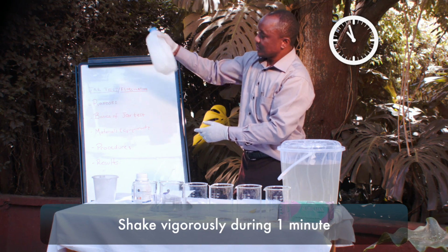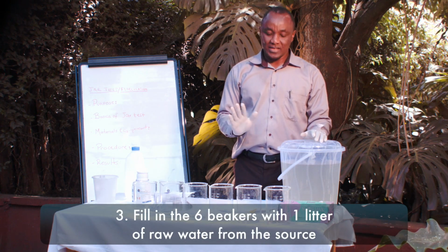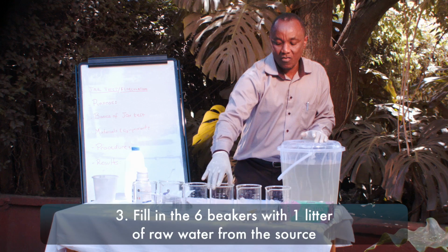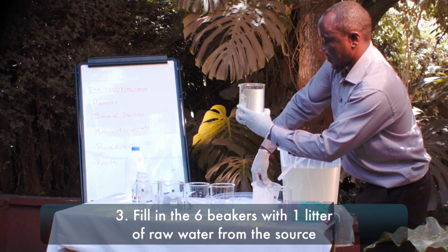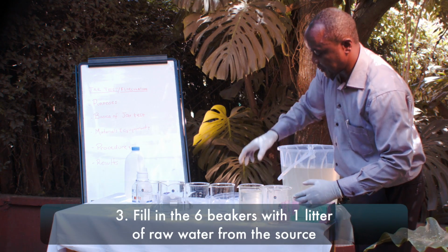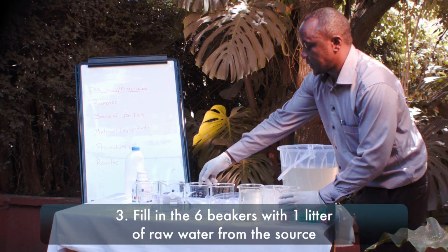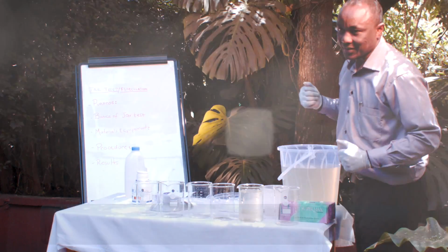The third step is to fill in these beakers with 1 liter of water from the source. That's 1 liter of raw water, to be treated. Fill all the rest the same, and then we go to the next step.